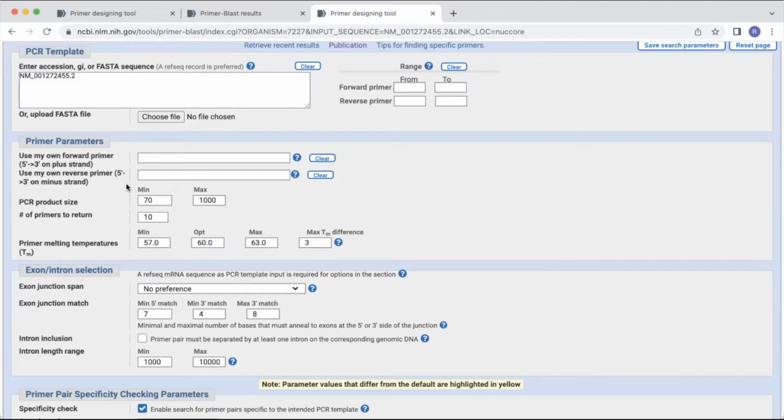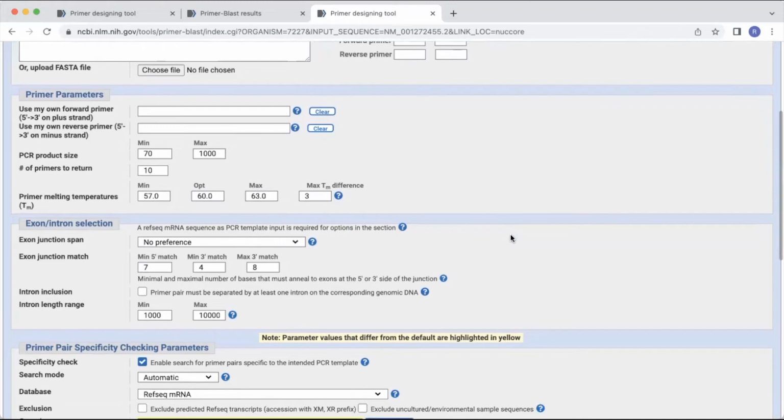However, a forward primer is just a DNA strand that attaches to the antisense strand of the DNA that runs in 3 to 5 direction. And reverse primers are DNA stretches that bind to the sense strand, that is the positive strand of the DNA, and that runs in 5 to 3 direction. This also helps us to select the exons and introns, which are also an important part of the nucleotide sequences. For your information, exons are termed as nucleic acid coding sequences which are present in mRNA, and introns are the non-coding sequences present in the DNA, which are removed by RNA splicing before translation.